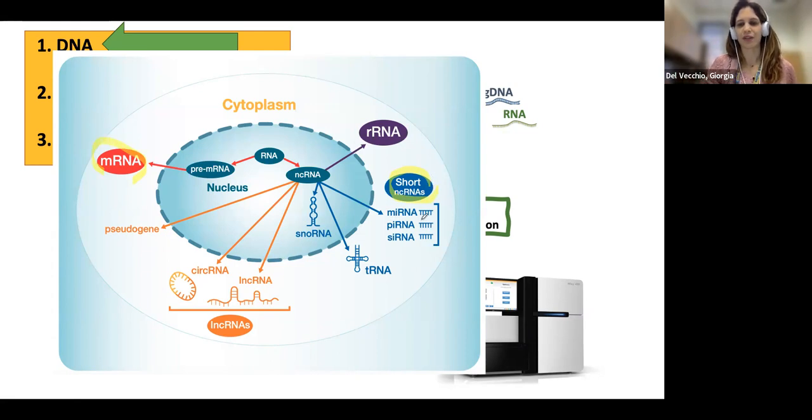We have microRNA, siRNA, and we also have ribosomal RNA, long non-coding RNA. So it's not just one molecule, it's a whole group of molecules.